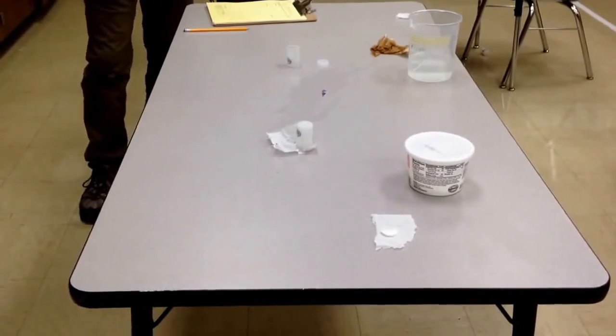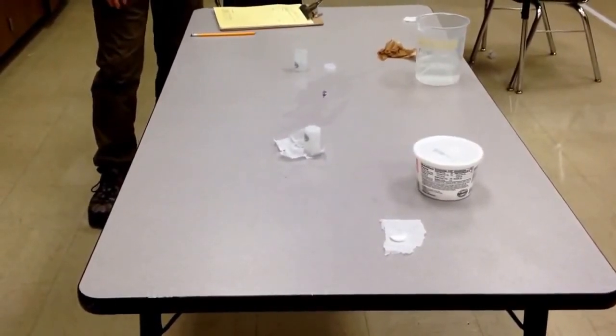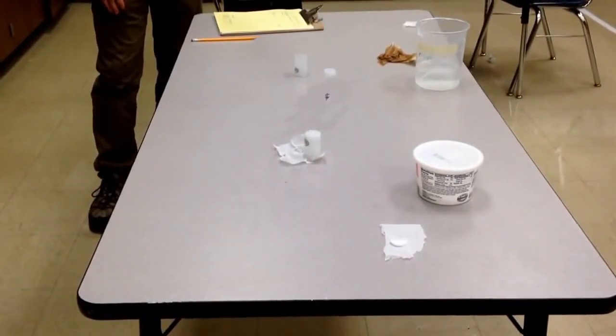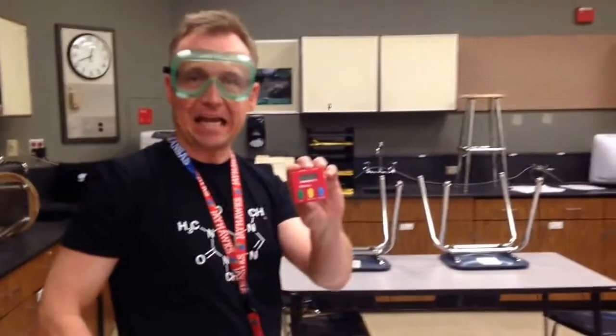Now we got 15.02 before. We're at 10 right now. 13. 16. Woo! That was a big pop. That was a bigger pop, all the way up. So we got 17.88. So I'm going to write that down on our data sheet here. 17.88 for the 3rd full container.